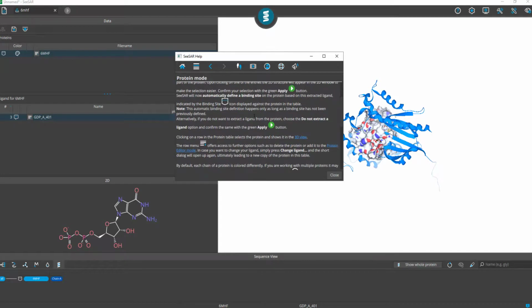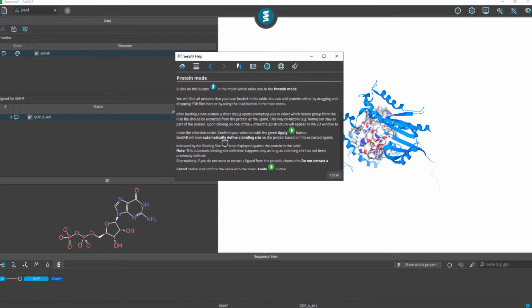More than just offering this textual help, there are few other resources, link outs to a beginner's guide, link outs to our tutorial movies, online help that's offered on the website, a first start help and also a page to look at what's new with the application in terms of updates.